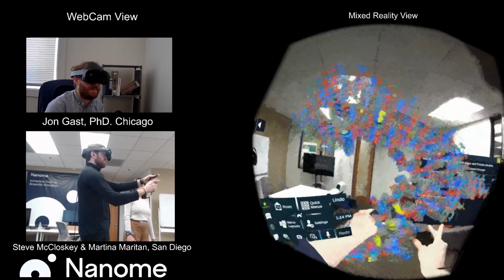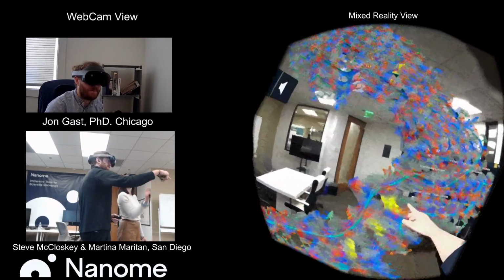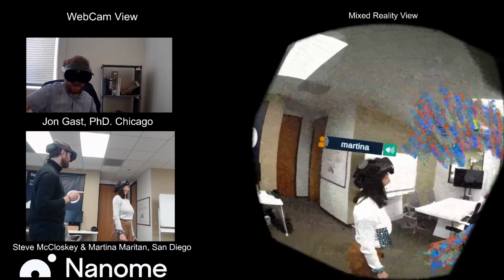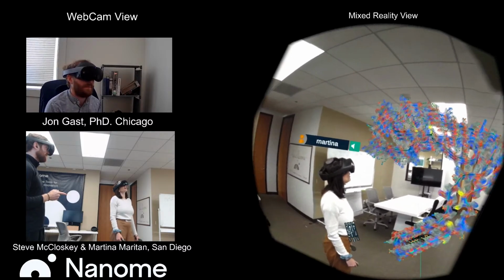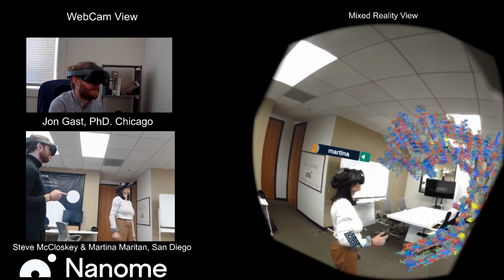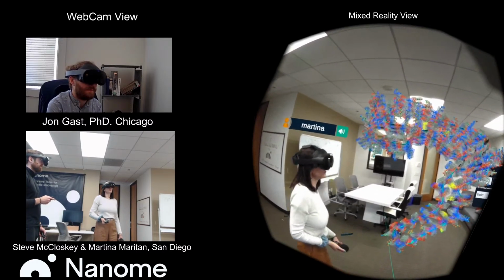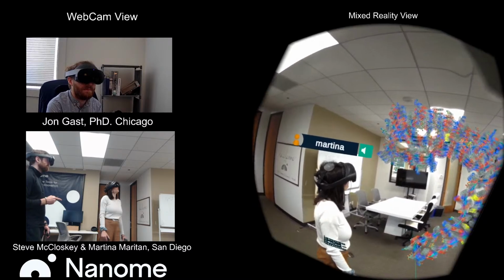And then there's also those cysteines that we were discussing just before the stream here, and how those add to a lot of the structural function as well. But yeah, sorry, Martina, were you pointing something out? I was just looking at the disulfides, and in general, what is remarkable of this amyloid structure, and is a feature that is common to all of them, is this incredible network of hydrogen bonds, and this is exactly what makes these fibrils so stable and hard to dissolve. So once they are formed, it's kind of impossible to go back.